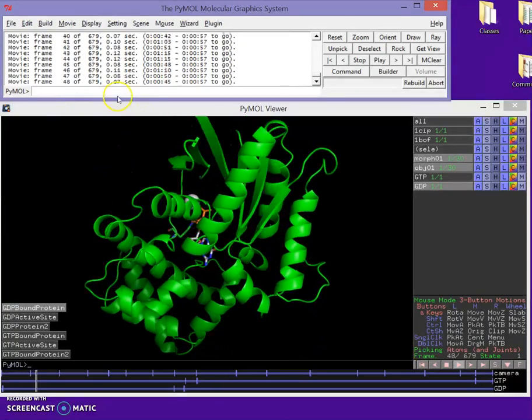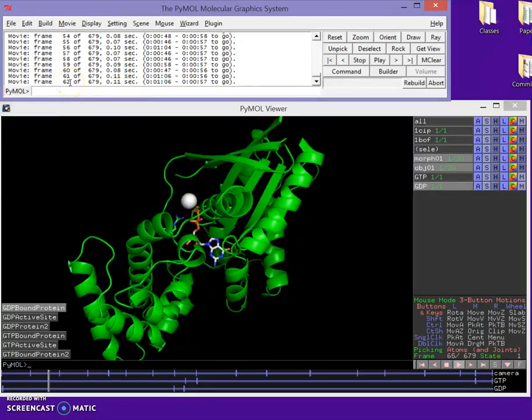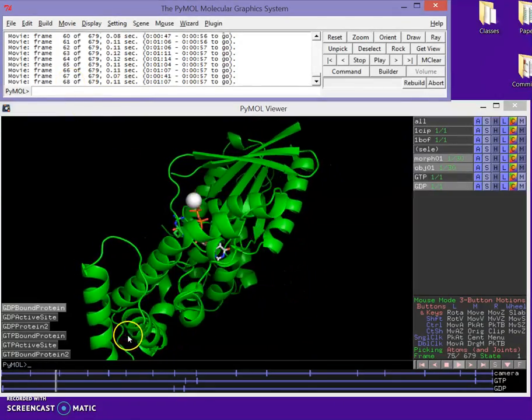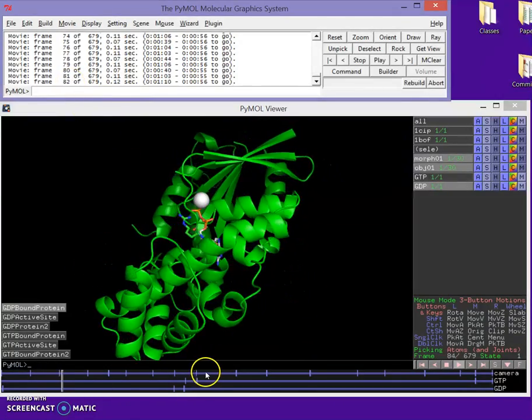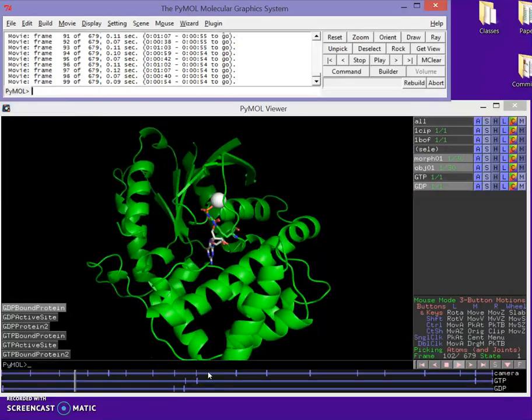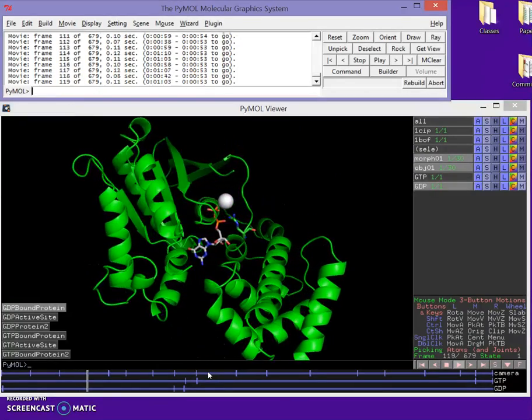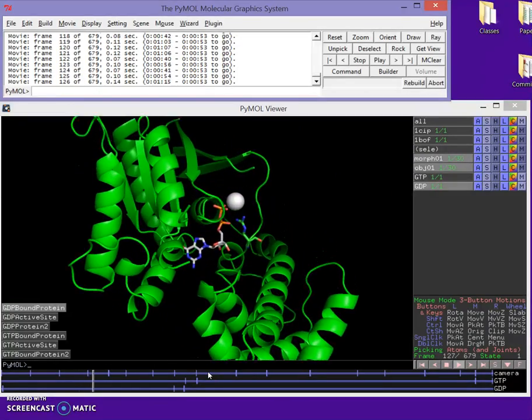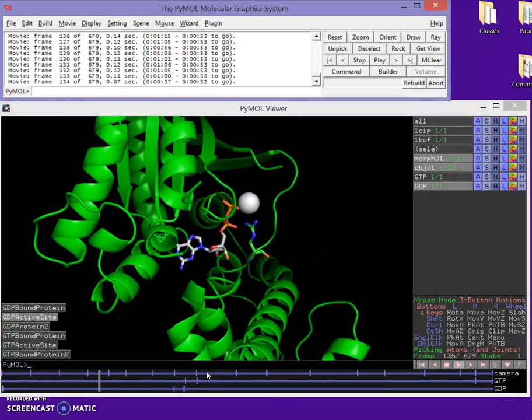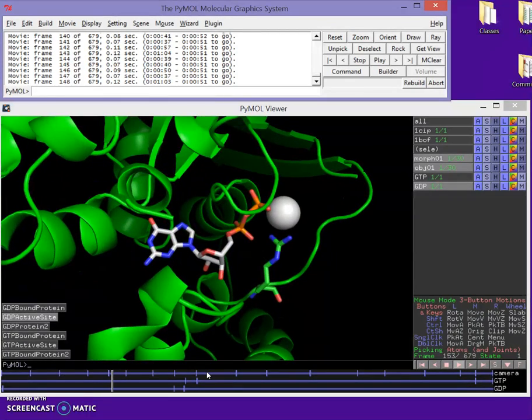It's just going to process all of our frames. We have 679 and it can take you track of where they're at. And it's going to play the movie for you. Now hopefully you fixed all your bugs before you processed the movie, otherwise you're going to have to redo it all. But it's going to give it kind of a slow-mo as you watch this movie.